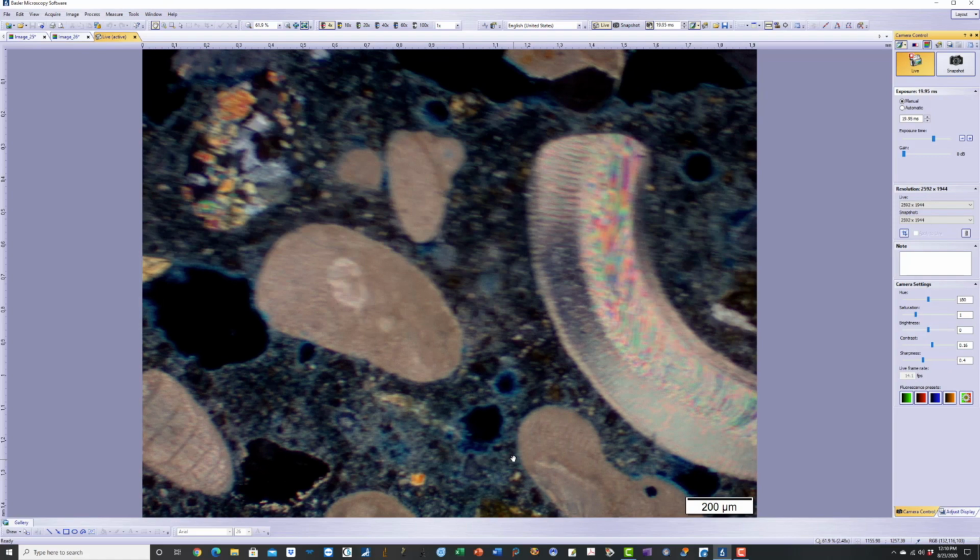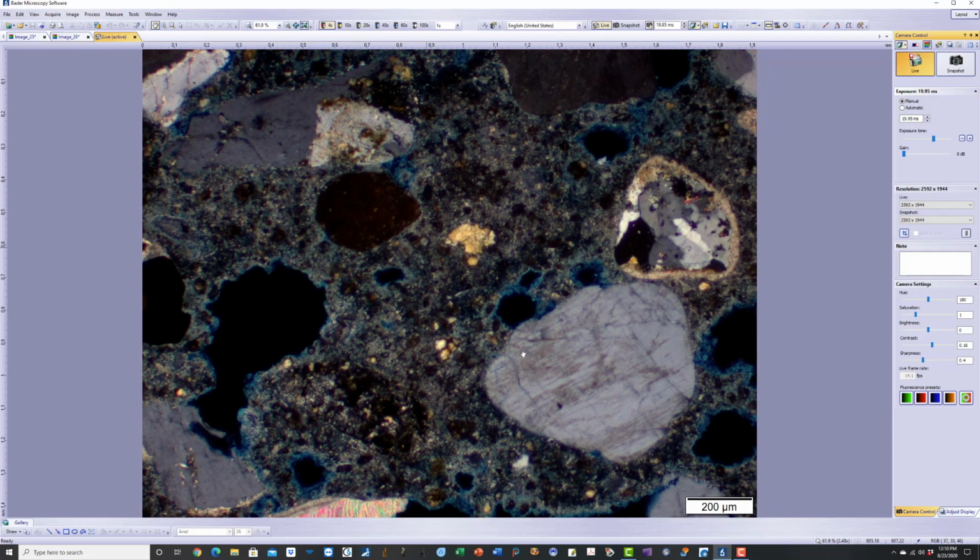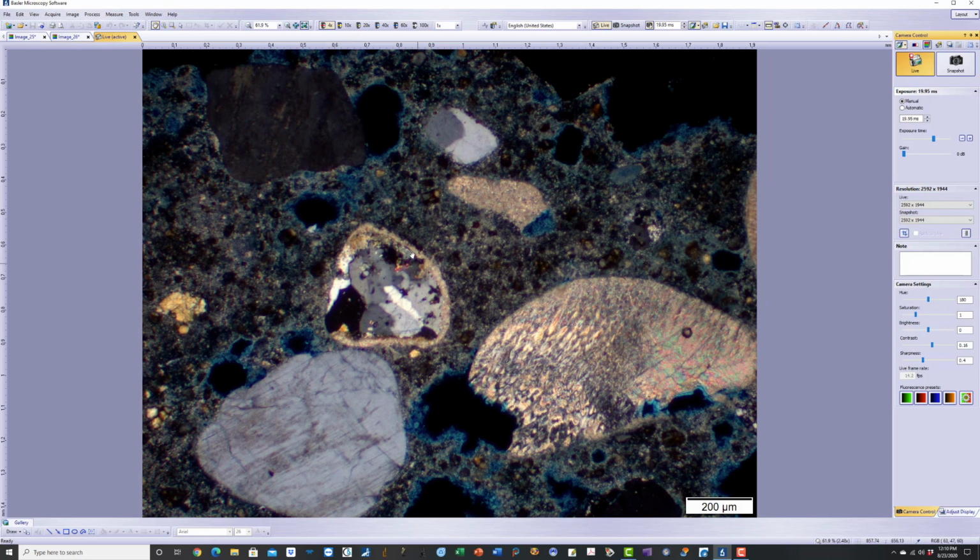You can see spectacular microstructure of the seashells, coarse grained calcite, the residual cement particles, feldspar. There is a small granite sample with secondary calcite rim around the granite, seashell.